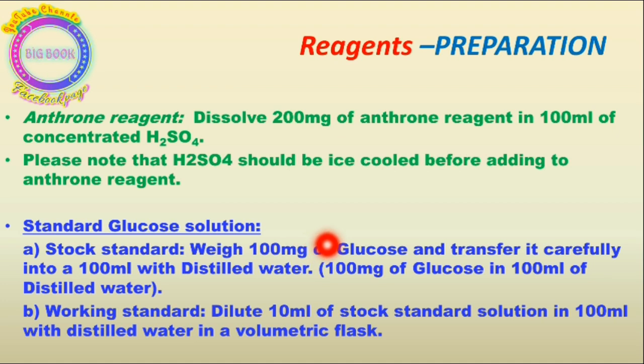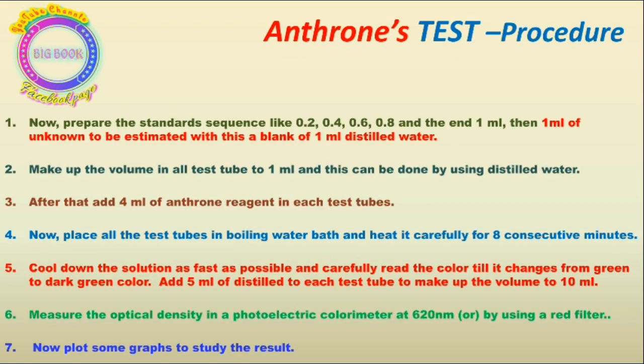One standard is the stock standard. After preparing that, we prepare the working standard. The working standard is the one we take into consideration for the further procedural steps.